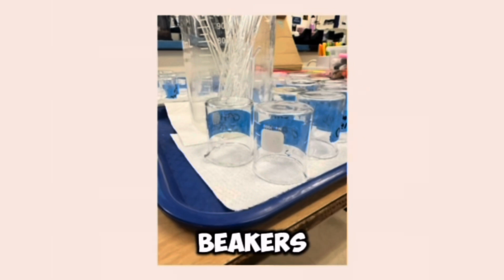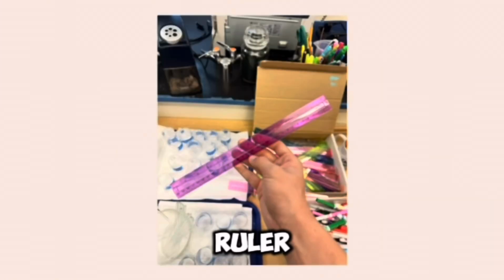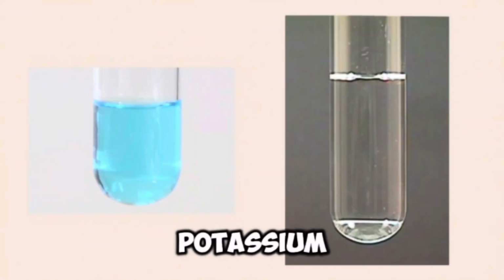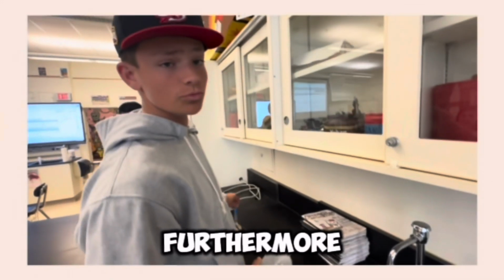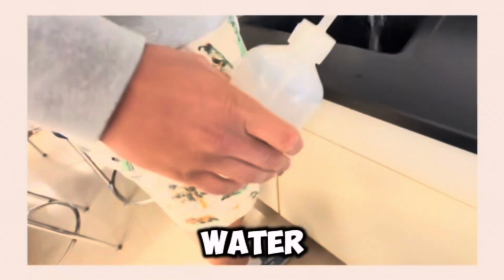To start our lab, we had 8 test tubes, 2 waste beakers, 2 burettes, 1 burette stand, 2 funnels, 1 ruler, 1 stir rod, 1 bottle of distilled water, a clamp, goggles, copper sulfate, and potassium hydroxide. We discerned that the potassium hydroxide was clear and cold, while the copper 2 sulfate was cold, light blue, and had no scent. Furthermore, we cleaned out the test tubes, beakers, and burettes with distilled water that was filtered.